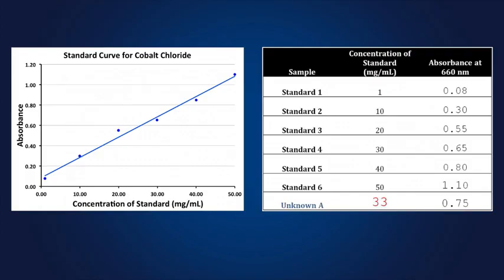Notice that if you have more than one unknown, you can use the same standard curve, as long as the solute and solvent of your unknowns and known standards are the same. When you finish your work, be sure to clean your lab bench area thoroughly and safely.